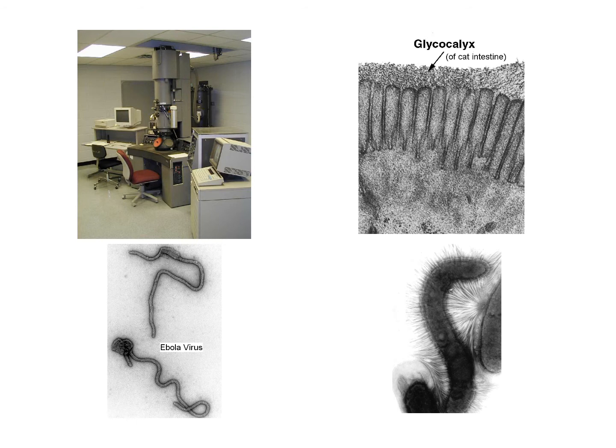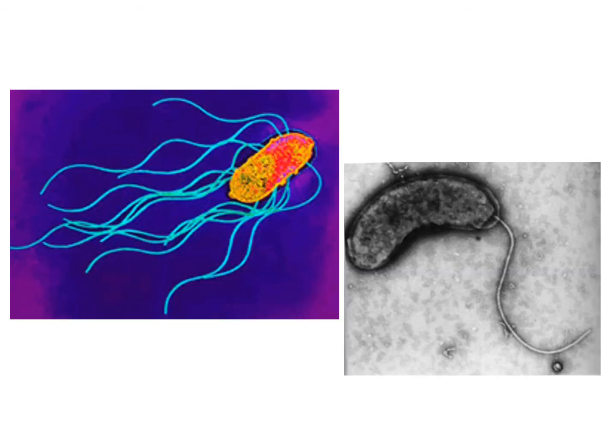But one of the things I do want you to know is that all electron micrographs are actually black and white. So here's a variety. They don't look as exciting. When you see a colored version, it has been photoshopped, and they really don't actually have any color. It's just artistic. And this is a beautiful little bacillus with blue flagella swimming around. Compared to the Vibrio with a single flagellum, it doesn't look as exciting, but that's actually the real deal. All of these are going to be black and white, and then an artist has basically created that beautiful color.